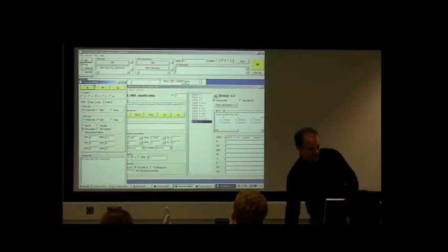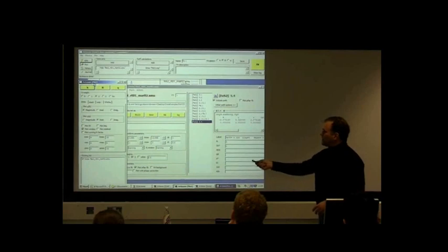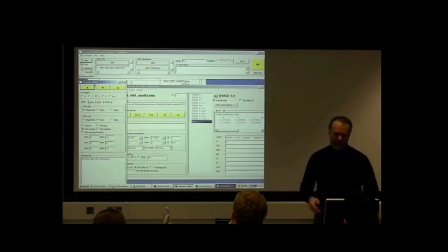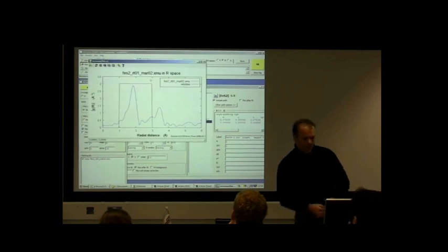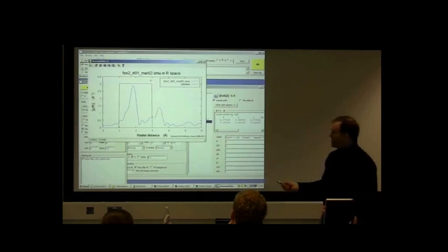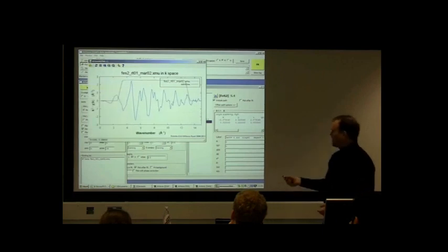So simply put, everything that's in this list down here will be plotted when you click these 3 buttons, and there's stuff all in this region that determines exactly how the plot gets made. So right now, if I click the R button, the data gets plotted in R, and if I click the K button, the data gets plotted in K because the data is the only thing in this list.